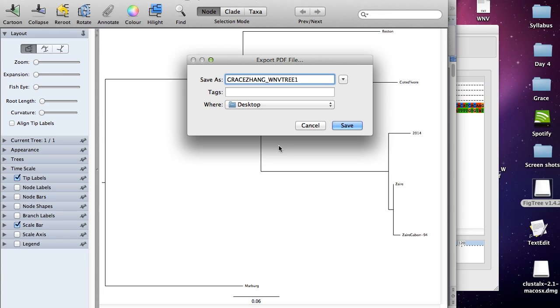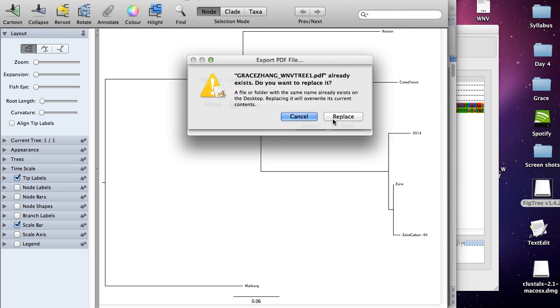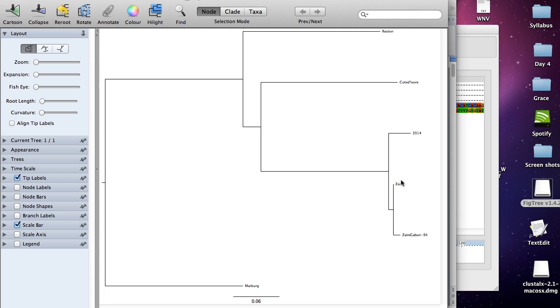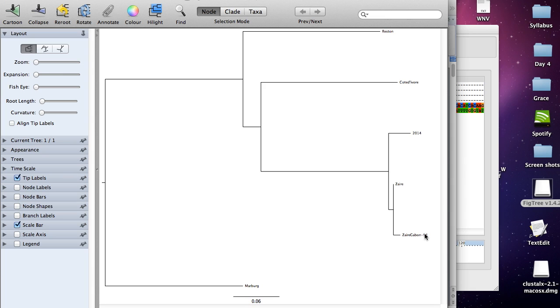Just one quick thing before I finish up. The tree gives you a good idea of which organisms are more closely related. We can see Zaire here, and we can say Zaire Gabon 94. These two organisms are more closely related than Zaire is to, let's say, Reston. However, this 2004 virus right here is equally related to Zaire and Zaire Gabon 94. Just keep this in mind when you're looking at these trees and trying to answer some of the questions.